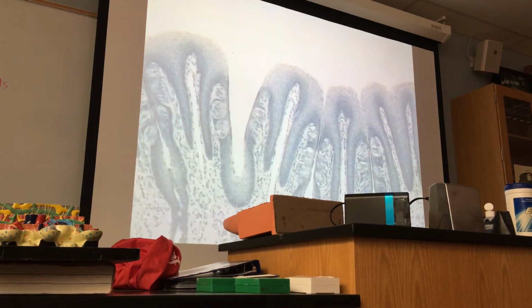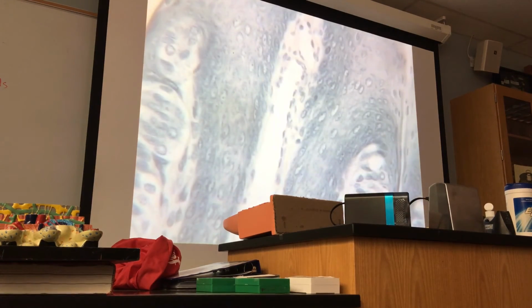You can see the papilla, individual papilla, one papilla, two papillae. Look here, no keratinized, no dead cell layers, and these are the buds. Even under higher magnification, that will look wonderful.